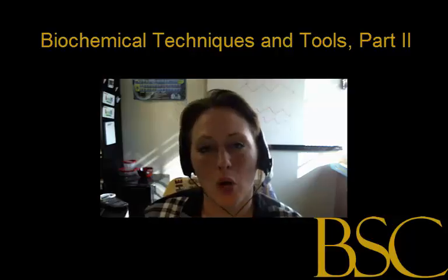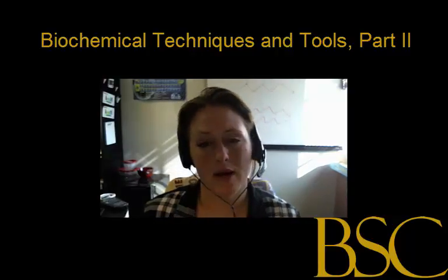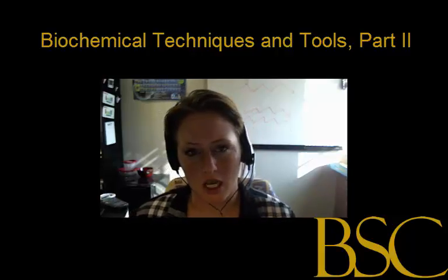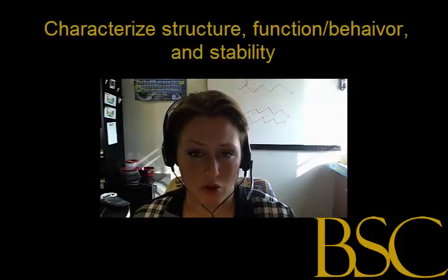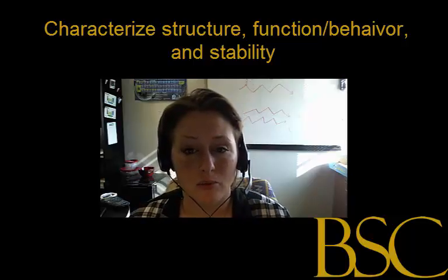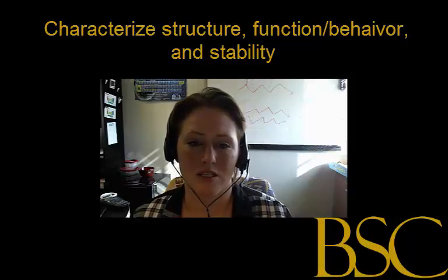If you recall from part 1, we looked at how a biochemist may express, isolate, and purify a protein of interest. In our case, we're looking at a protein called Verbosase. And now in part 2, we're going to look at how we can characterize this protein Verbosase using techniques that can help us characterize the structure of the protein, the behavior of the protein, as well as the stability of the protein.